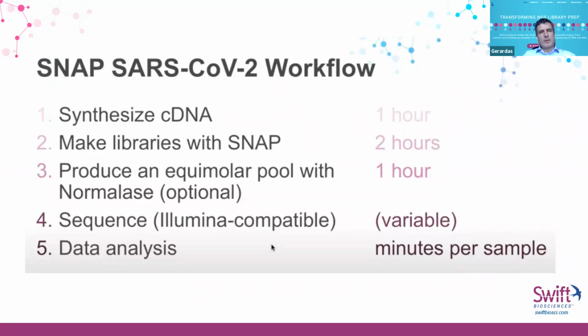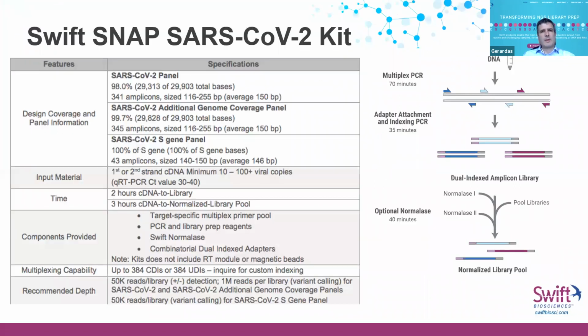And then to complete, we do have a command line, which is a set of a few steps that are connected in a seamless workflow, and we can share with you our developed piece of analysis with your bioinformatics. The question is that you have to have the bioinformatics person be able to help you understand the command line that we developed at Swift. And I will come to this in my next slides.